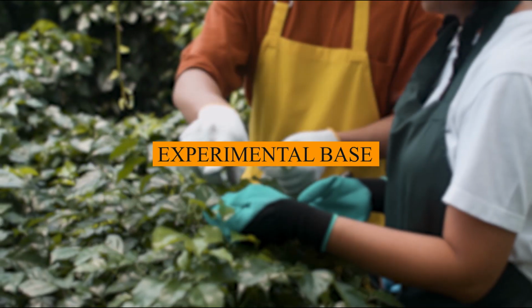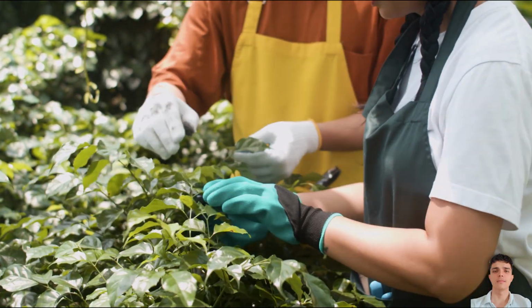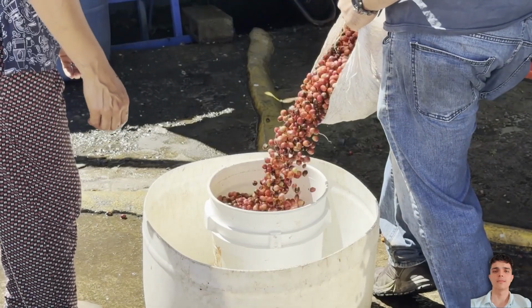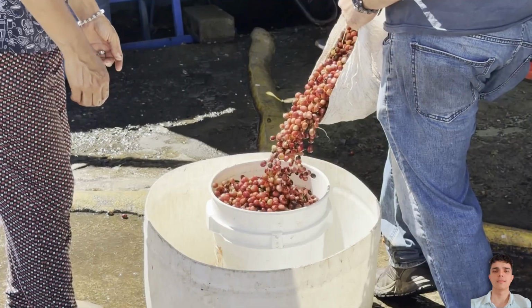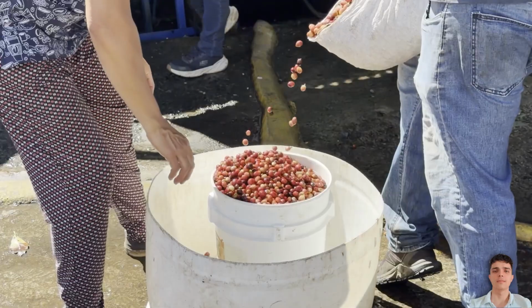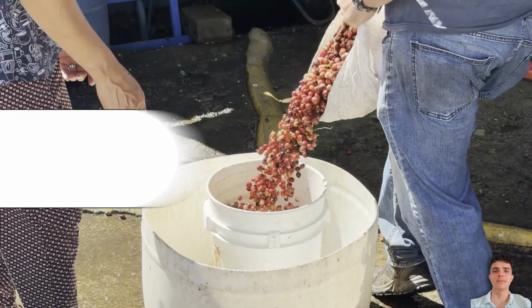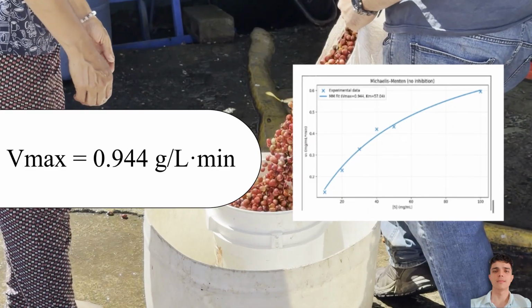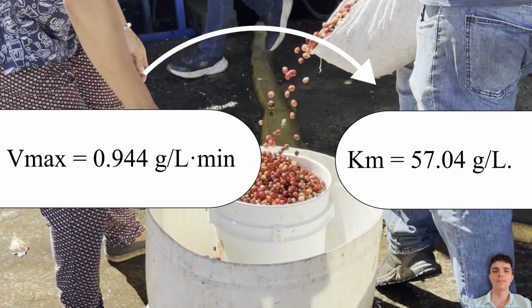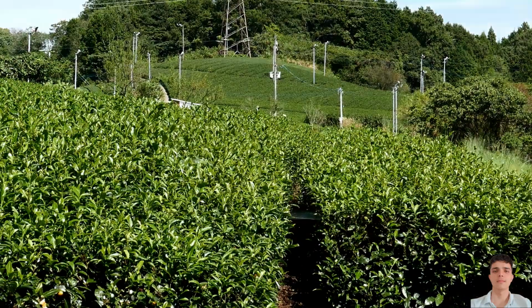Experimental base. We designed 35 microassays to model the hydrolysis kinetics. From glucose production curves, we calculated the initial velocities and built the Michaelis-Menten model. Our kinetic parameters were Vmax 0.944 grams per liter per minute and Km 57.04 grams per liter.